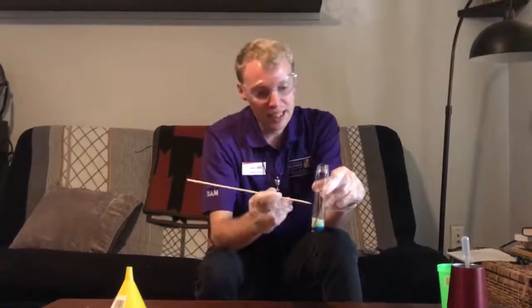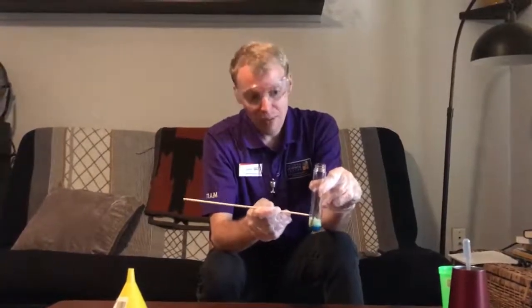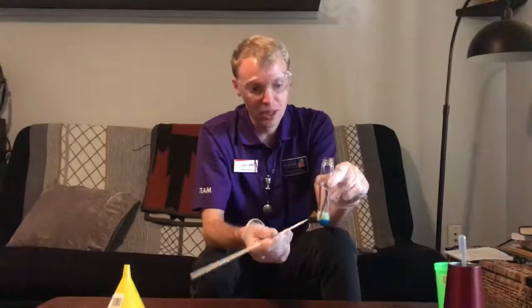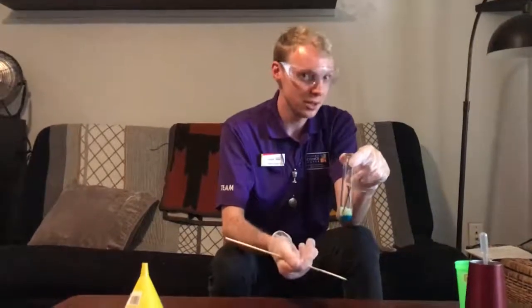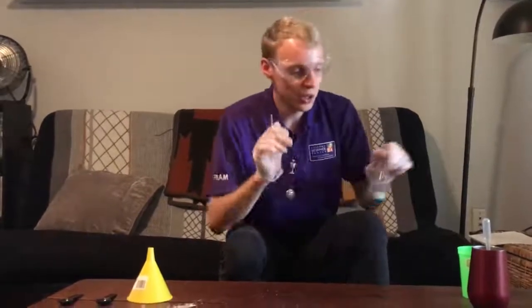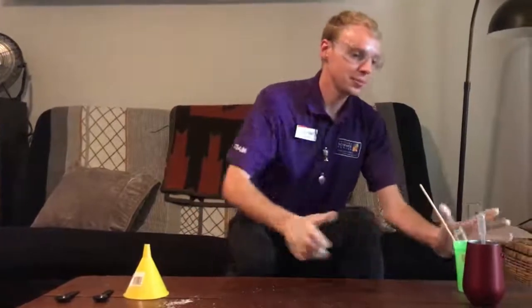And then once this nail gets introduced, the nail, which is iron, the iron in the nail is much more stable and much more attractive to chlorine. So the chlorine is like, hey, we're going to bond to all the iron, and that essentially leaves the copper all alone, which is really all it ever wanted in the first place. So what does that look like, you asked? So glad you asked, internet. I'll show you, because I made some examples over the weekend.